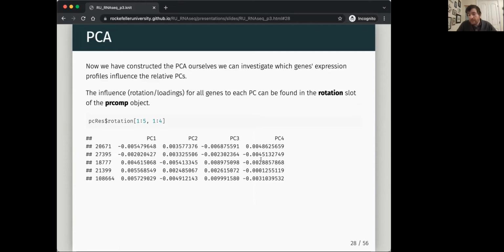And so sometimes we experience cases where the differential gene expression isn't working very well. Maybe there's quite a lot of variance, but despite the variance, we can actually see a PC that explains what we're seeing. But there's a lot of variance in one of the other PCs, which makes it really hard to do the differential gene expression. Maybe there's a batch effect or something like that. We can use the PCs in those cases to start to identify the candidate genes. What are the genes that are interesting when the differential gene expression isn't working? So this is a tool we lean on for things like that.